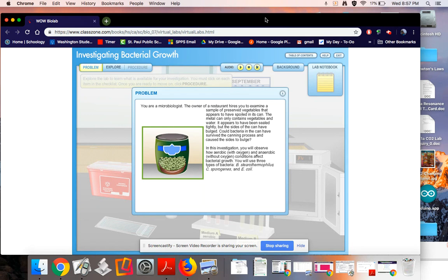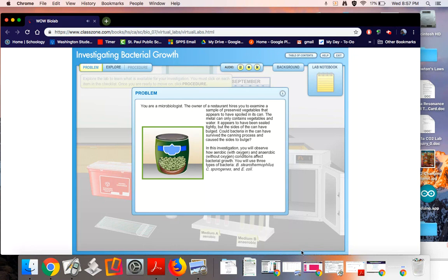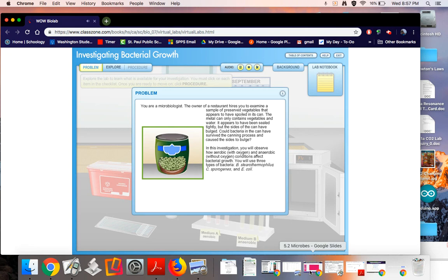Let's first hear what our problem is going to be. You are a microbiologist. The owner of a restaurant hires you to examine a sample of preserved vegetables that appears to have spoiled in its can. The metal can only contains vegetables and water. It appears to have been sealed tightly, but the sides of the can have bulged. Could bacteria in the can have survived the canning process and caused the sides to bulge?